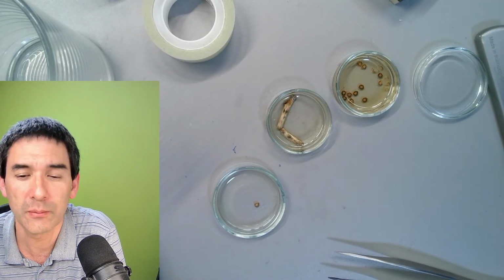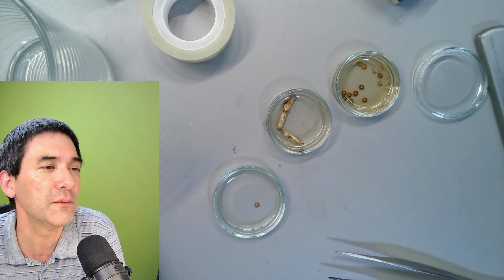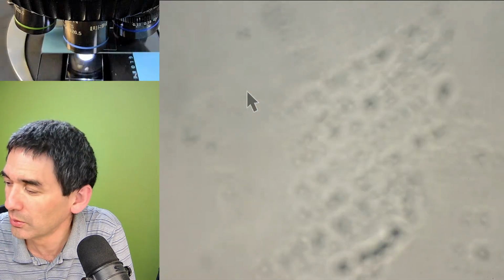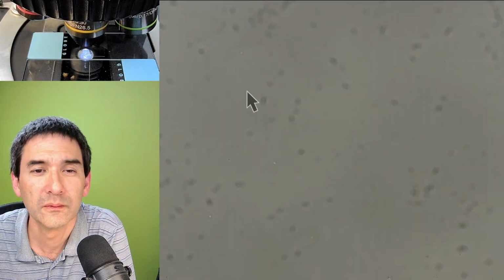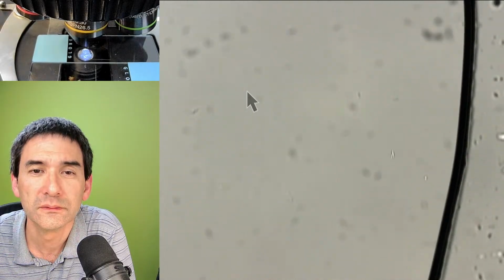And I think what I'm going to do now is, it's already almost 1.5 hours, let's have a quick look again if the face mite is still alive. Yeah, that's the oak wood. Finding the specimen is always a challenge. That's the edge of the slide.